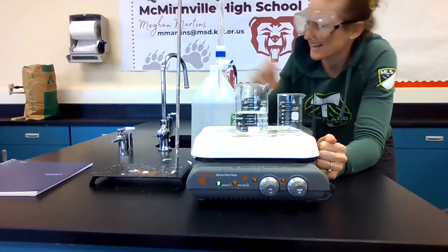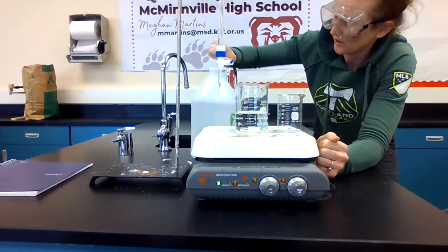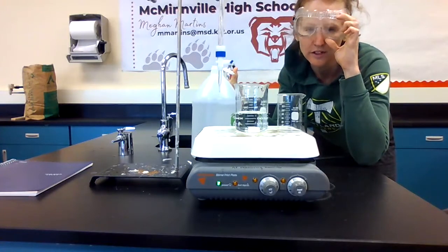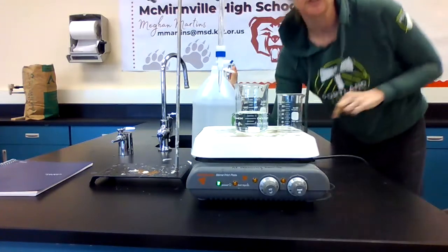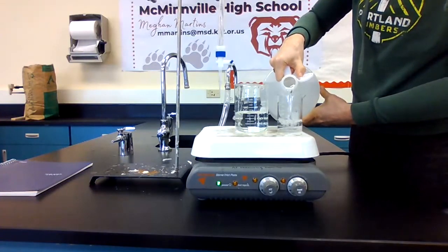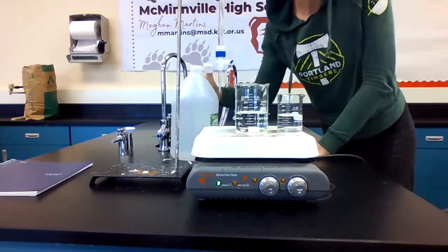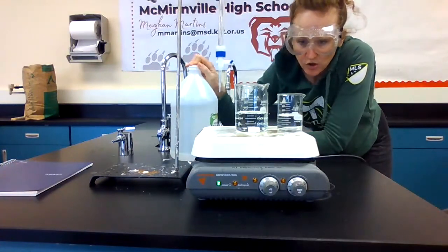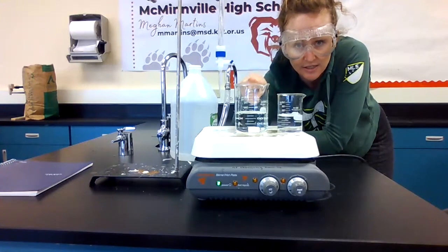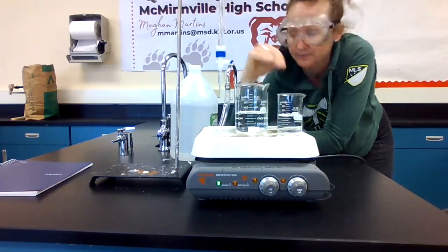Vinegar is acetic acid. Now, in a titration, we're going to have a color change. One of the helpful things you can do for yourself is set up two beakers with the same initial solution. That color change is going to guide us, so we're going to have this as a comparison. When I see a difference between the color of the two solutions, I'm going to stop right away.